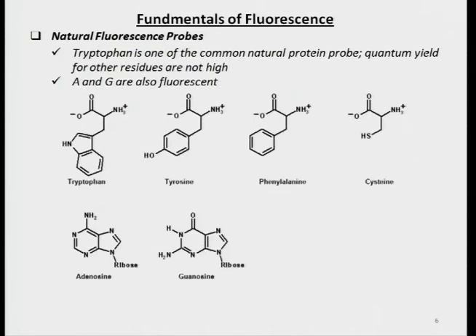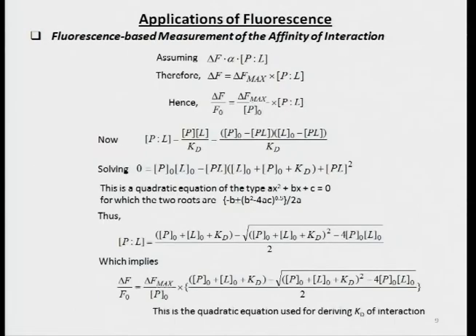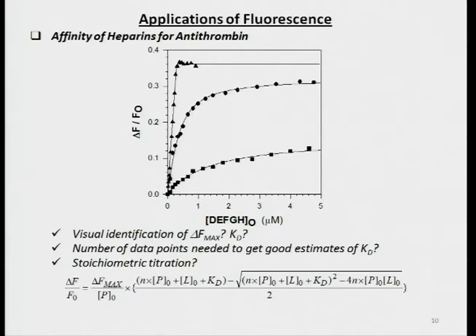So Mausam, does that explain? Yeah, I understand that. Now you said that intensity has to change after binding. If the intensity changes, there is some structural modification in the fluorophore, because the fluorescence has to come from the fluorophore, right? Is it a non-covalent interaction which leads to the decrease or increase in intensity? It can be non-covalent, it can be covalent, it can be either.